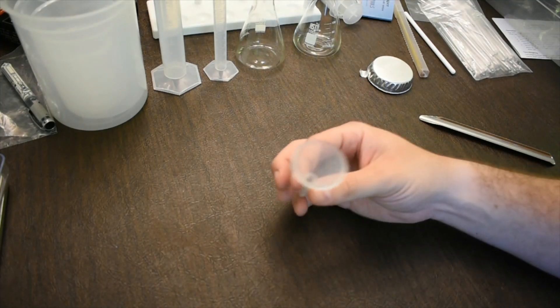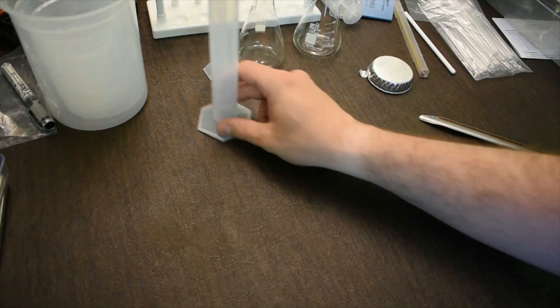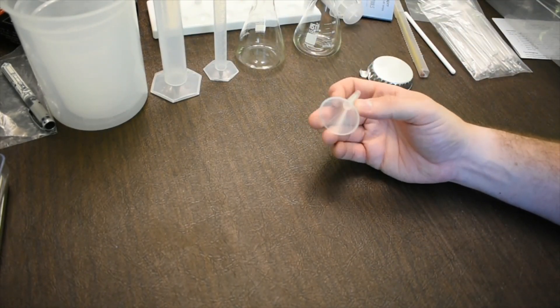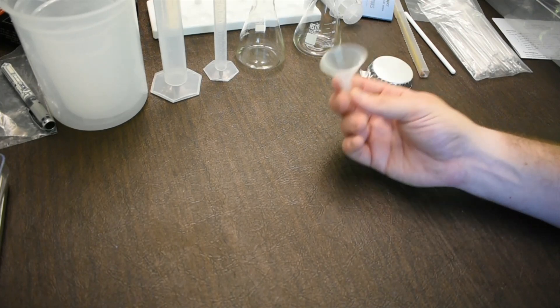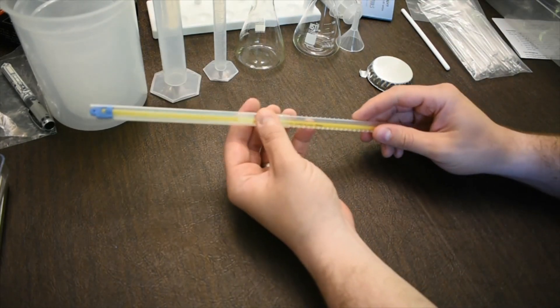We also have a funnel, which is pretty self-explanatory. You might use it to transfer liquid into a graduated cylinder or another container. Funnels are helpful because they provide a much wider opening for transferring liquids.